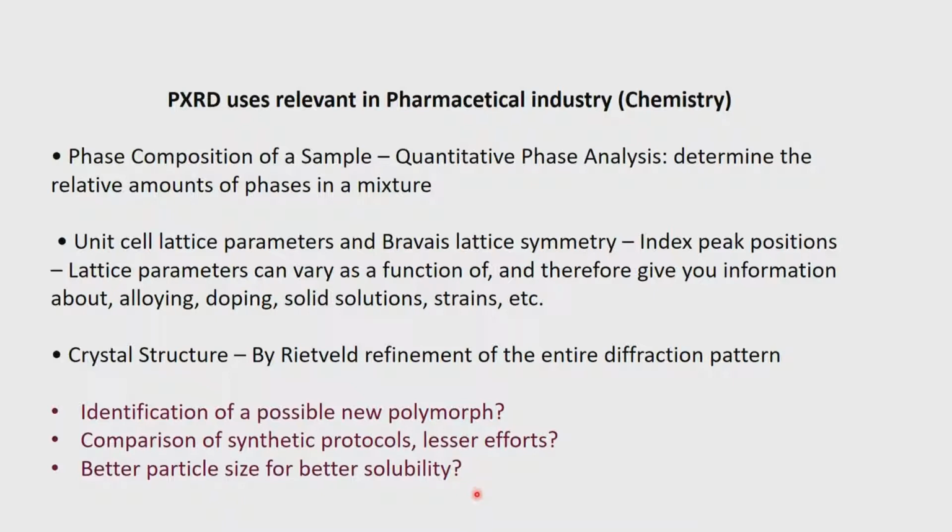Solubility is a major issue in the case of pharmaceutical materials, particularly as most of the pharmaceutical materials are delivered or administered in solid form, and therefore, the powder diffraction of these materials becomes very, very crucial. So, this is a very basic technique that has to be employed in the pharma industry in order to characterize these solid pharmaceutical materials.